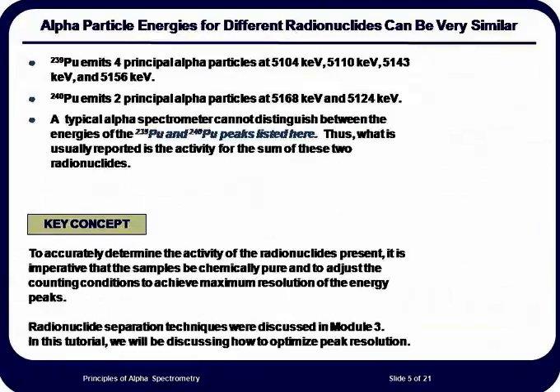Plutonium has several long-lived radionuclides that are alpha emitters. Plutonium-239 has 4 alpha particle energies as noted on the slide, and plutonium-240 has 2 alpha particle energies. Note that the energies of the 6 different alpha particles only differ by 64 keV. Resolution is the ability of the spectrometry system to differentiate between 2 different alpha particles. The resolution for alpha particle energies with routine laboratory methods is between 40 and 100 keV, mainly dependent upon the technique of the analyst.